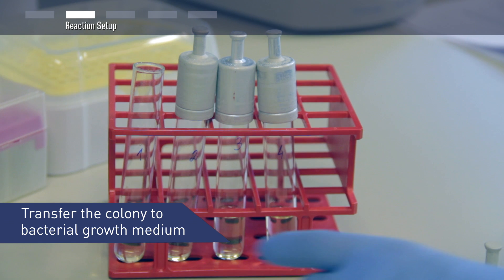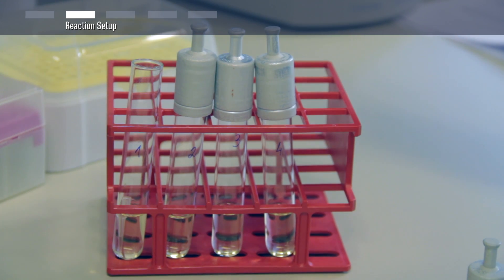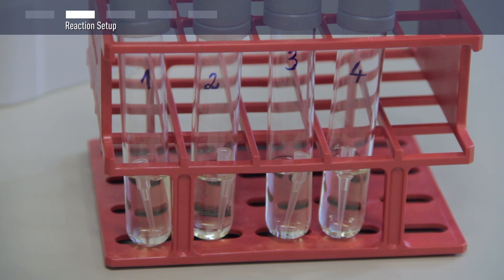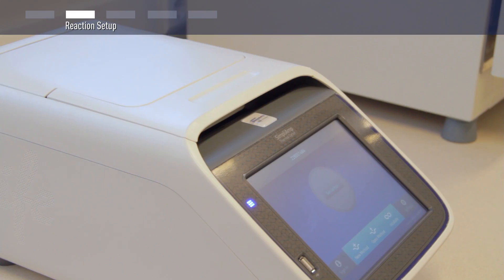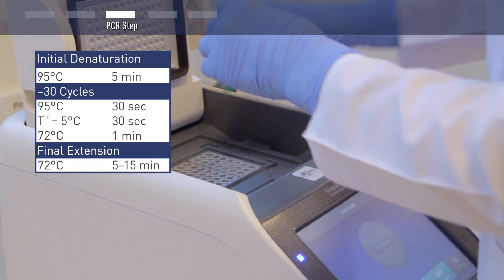Finally, transfer the tip into a labeled culture tube containing bacterial growth medium to grow bacterial cells for DNA purification. After you have picked all of the colonies, proceed with the PCR.